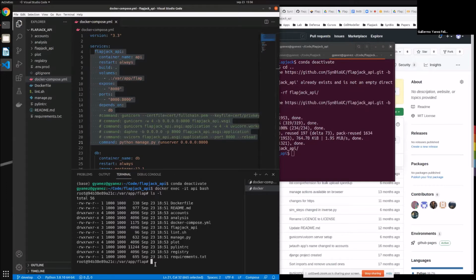So in order for this database to interact with Django, Django has an ORM, which is the one that connects the SQL database with Django via Python objects.